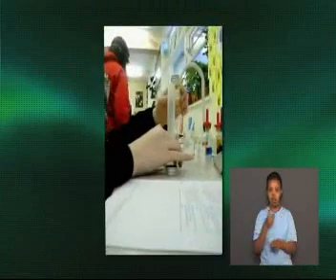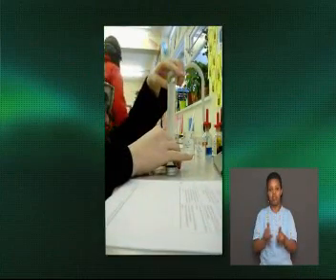The grease spot test is a good method to determine if lipids are present. However, this test cannot determine the amount of lipids in a substance. Typically, a chemical reaction is necessary to find out a comprehensive result in substances. The next test we will look at is the emulsion test.